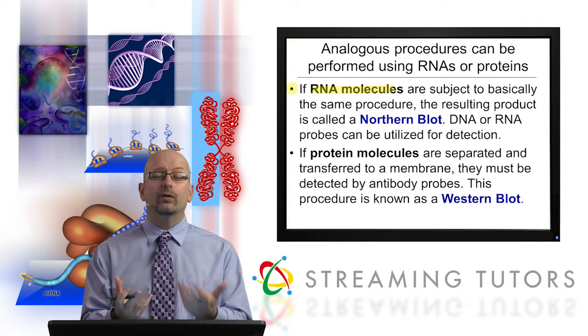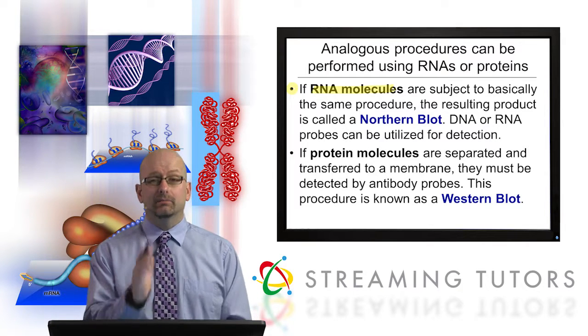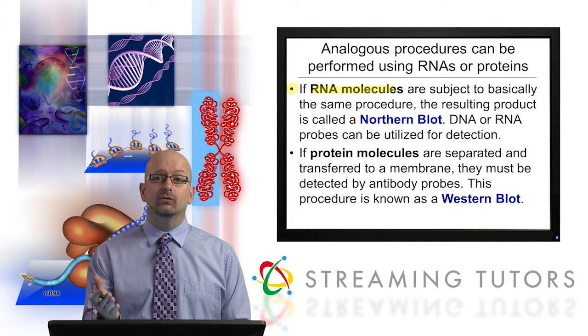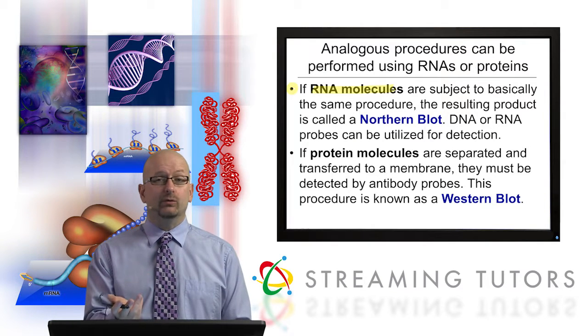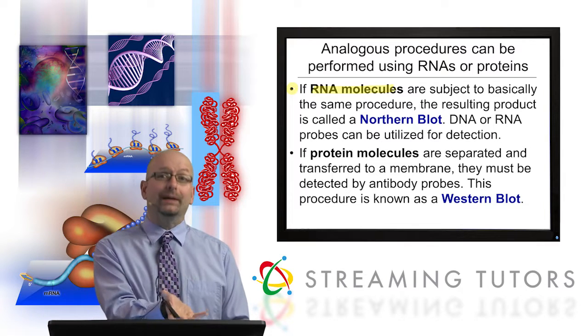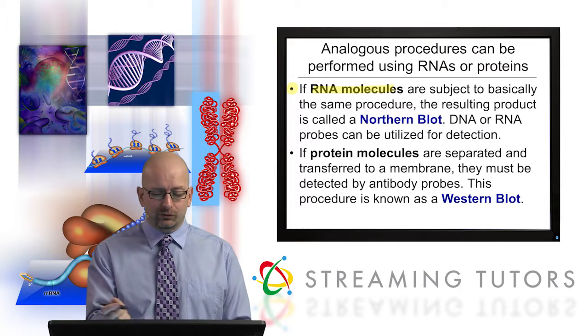You could gather all the RNAs, say, from a kidney in a human being, and chop them all up with restriction enzymes, and gel electrophorese them, I think that's a verb, and then probe it and see if you find the gene of interest. It would be the gene of interest being expressed on a messenger RNA, but you're screening and looking for a messenger RNA.